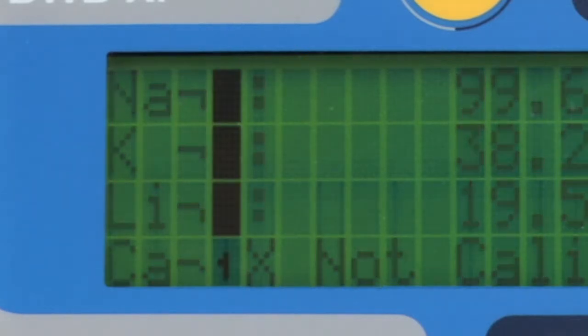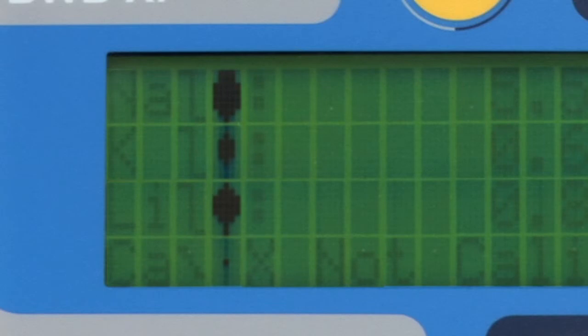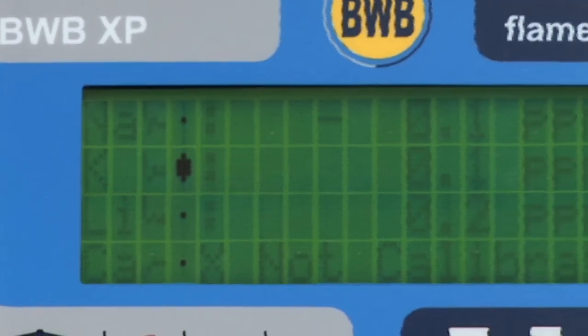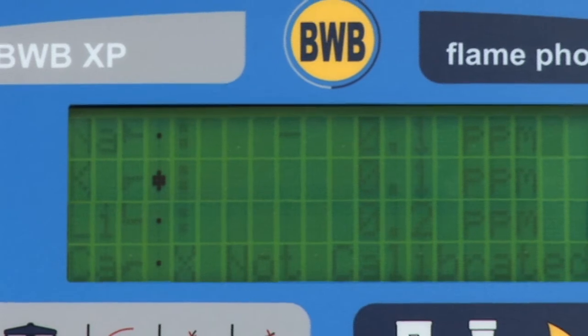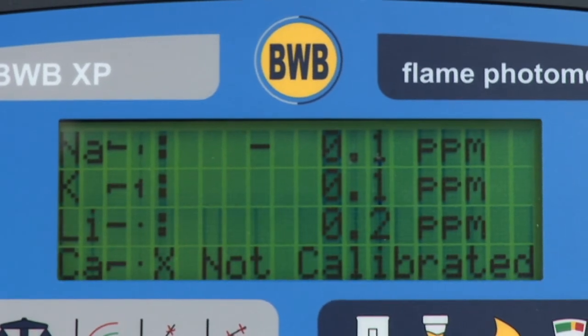The second icon represents the noise in the system. A full black rectangle means that there is a lot of noise. A single dot means that there is very little noise. When a sample is first introduced, the icon will change to completely black and will gradually reduce to a single dot. A reading should only be taken when the icon shows a single dot.